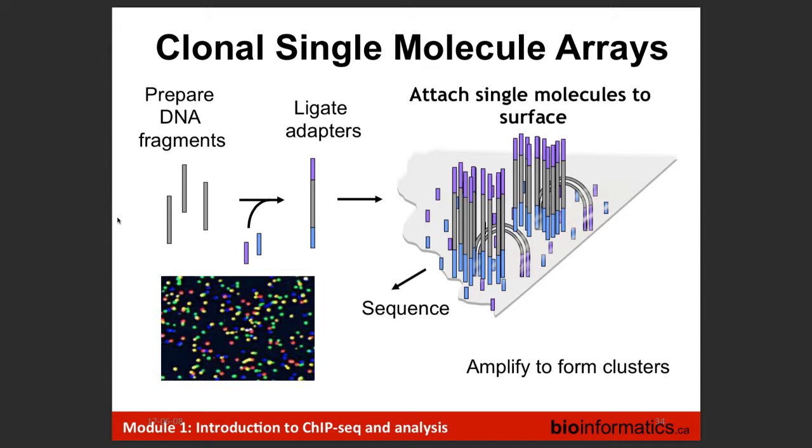Yeah? Does it mean that all the reads start at the same site because it was digested like always? No, they don't. So it's chewing at the ends of the open, well, at least the way we think about it is that you've got a nucleosome, and you've got DNA. So it's chewing in between, but it isn't just in one spot. It can chew all the way in on either way.